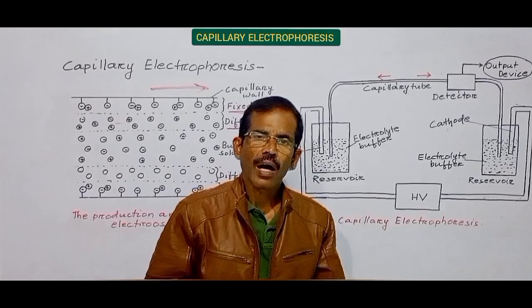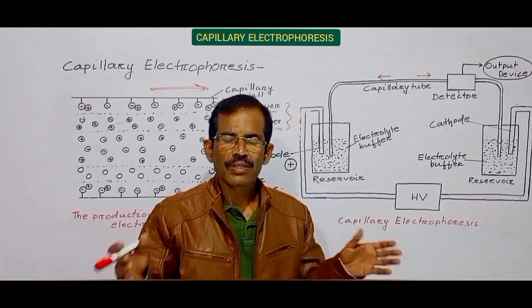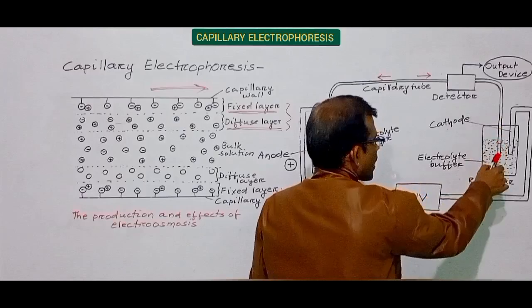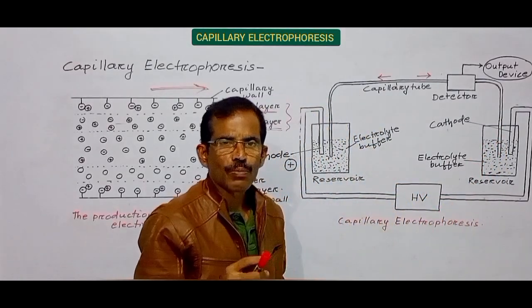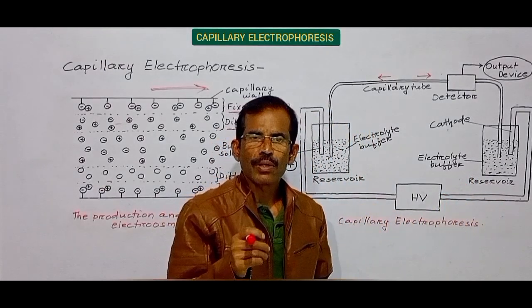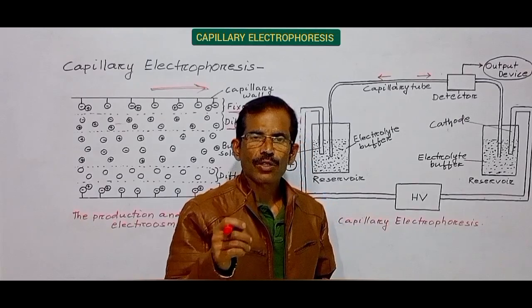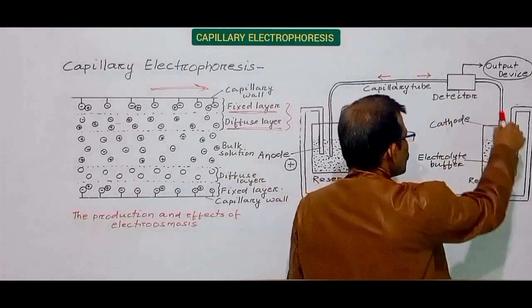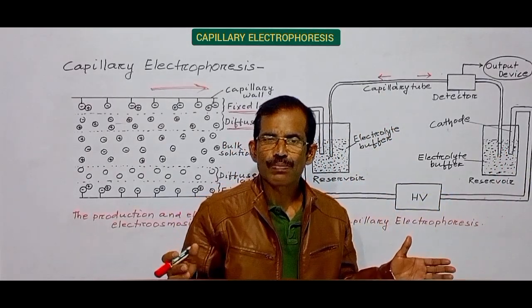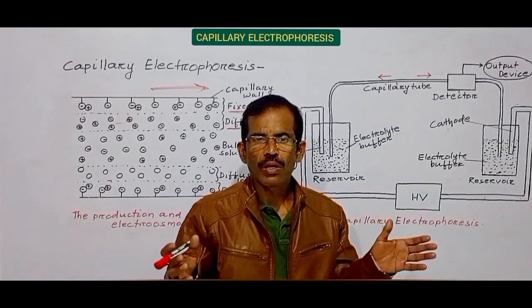It is because of the higher electroosmotic flow that all ions, regardless of their charge sign, and neutral species are carried towards the cathode. Positively charged molecules will reach the cathode first. This is because the combination of electrophoretic migration and the electroosmotic flow cause them to move faster. Positively charged molecules will be followed by neutral species, which in turn will be followed by negatively charged molecules.